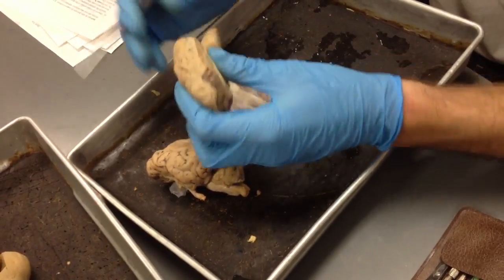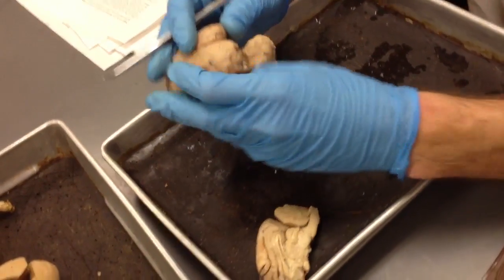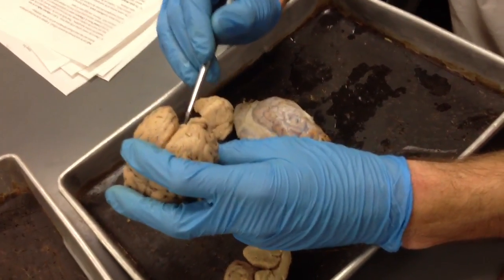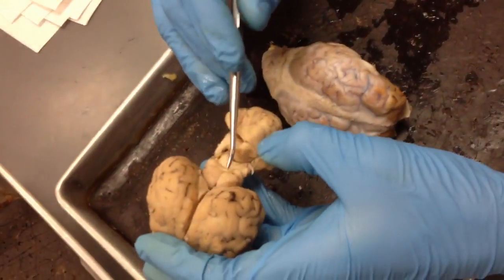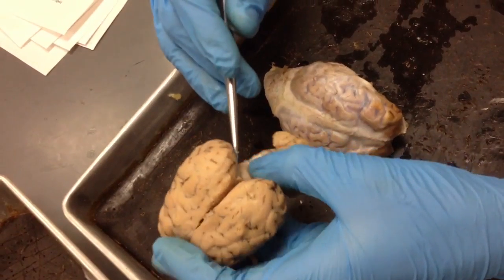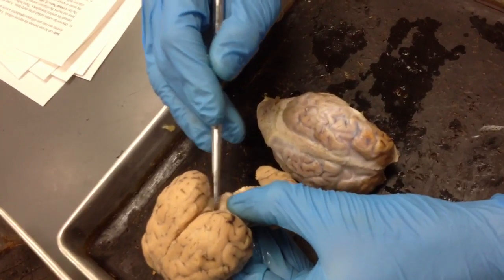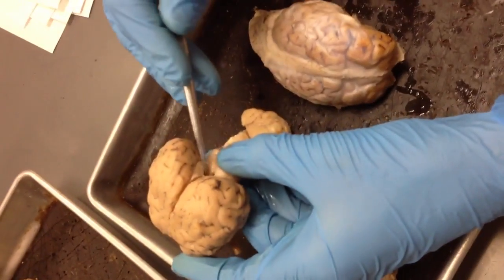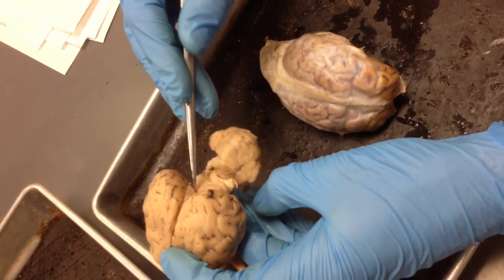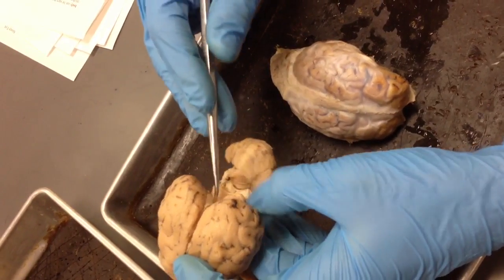Tectum. The tectum. Roof of the midbrain. Makes up the midbrain. So it's got the pineal body above. Okay, we'll start here then. So this is our corpus quadrigemina, made up of superior colliculi, these two, and inferior colliculi, these two. So that's our corpus quadrigemina. There's a pineal body right here. That's going to be the last portion of our tectum. So our entire midbrain's right here. Tectum. This is our corpus quadrigemina. Superior colliculi, inferior colliculi, pineal body.